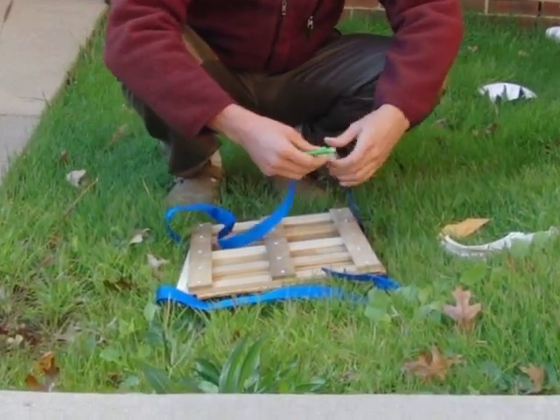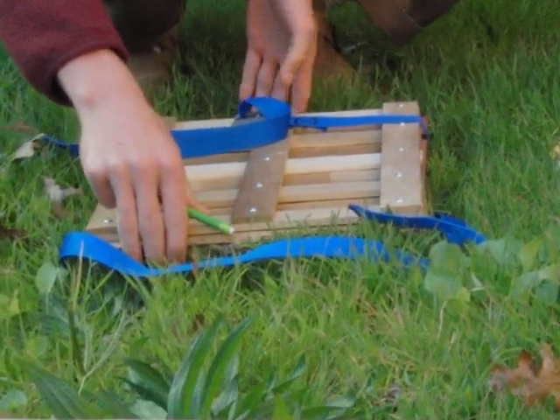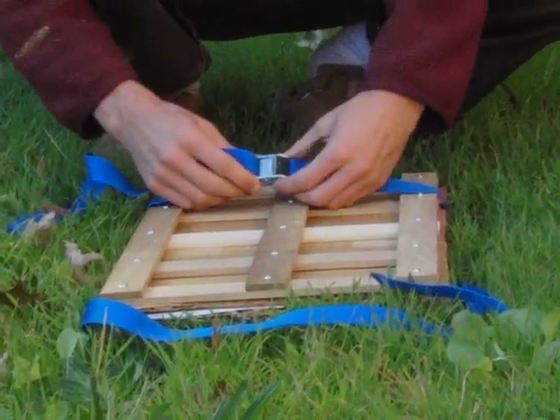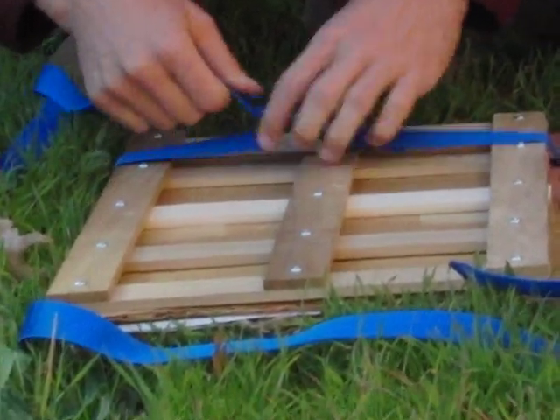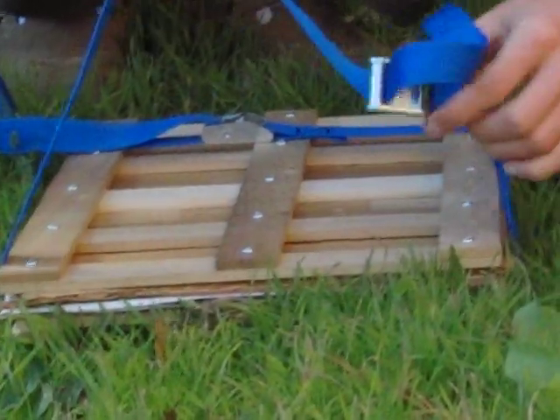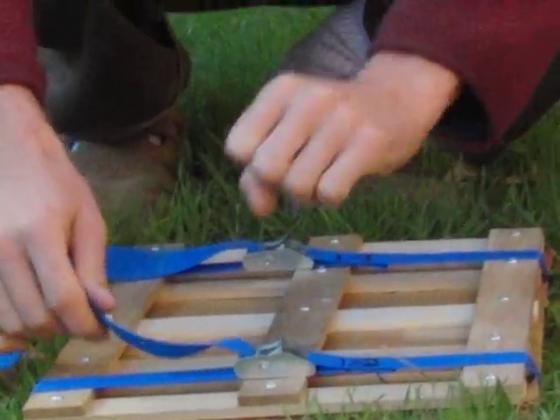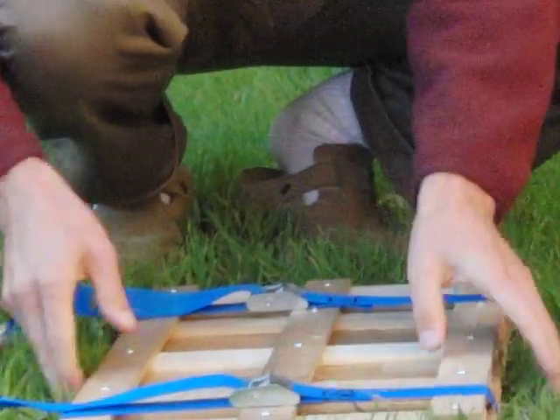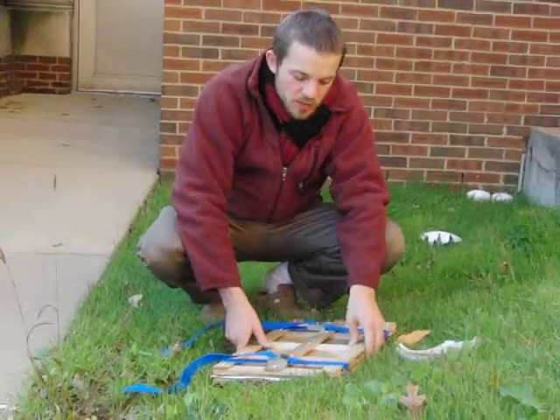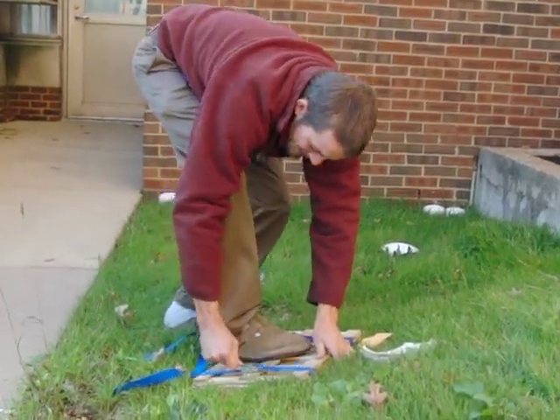Then use some kind of strap to hold the press down. We use straps with a rough edge that you pull tight and they stay secure, so you can get the plant nicely compressed. You can also use a ratcheting mechanism. Now the plant is pressed — get it as tight as possible; if the press is sturdy enough you can even stand on it.